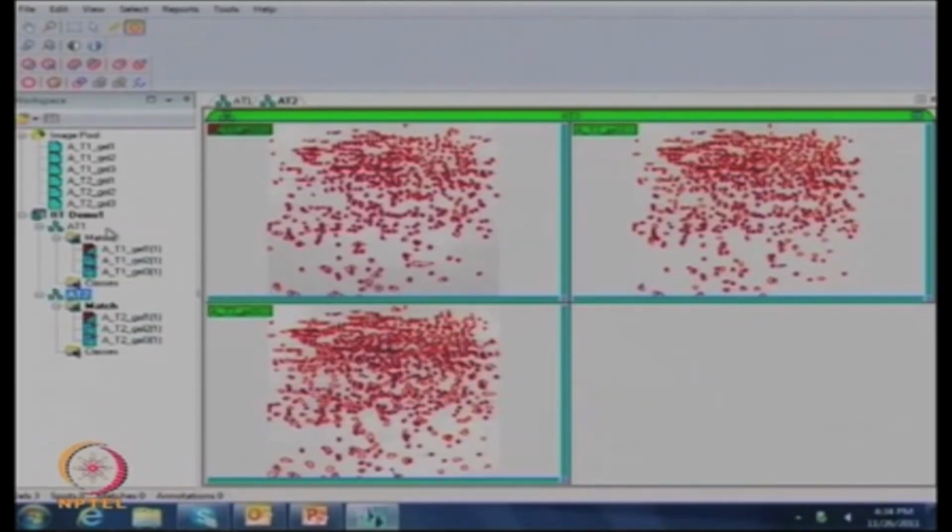Now one can do class analysis between these two classes, like interclass and intraclass. Between the control and treatment groups, one can now do the statistical analysis. Now I am creating the classes here. Otherwise, before that I would like to go to one report point.